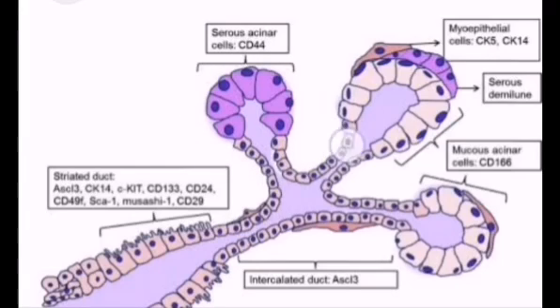And if you find a mucus acini but it is capped by a serous acini, then it is known as serous demilune, right? And what about the striated ducts? So these are the ducts having a columnar epithelium, right? And they will have a basal striation, right? That's why they are named striated ducts. So basically these are the columnar cells, right?